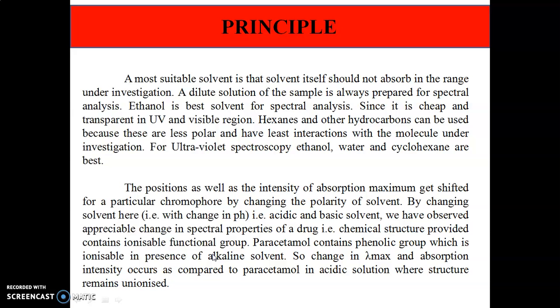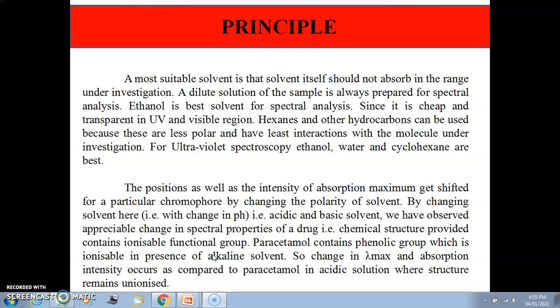The choice of the solvent to be used in ultraviolet spectroscopy is quite important. There are criteria. The first criterion for a good solvent is that it should not absorb UV radiation in the same region as the substance whose spectrum is being determined. Usually, solvents that do not contain a conjugated system are most suitable for this purpose.